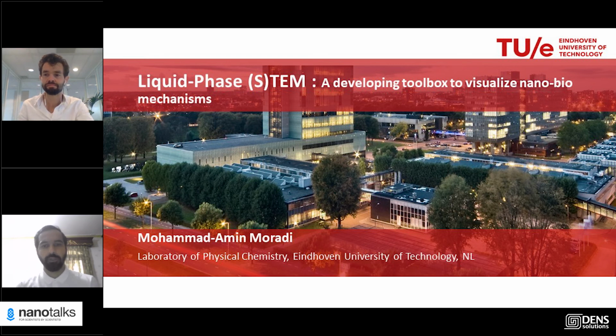Well, what I wanted to give the audience as the message here was that with graphene and the flexibility of the graphene to stand on any kind of spacer, you can adjust the medium, or let's say the aquarium, that you want to run your experiments in. So any kind of material you want to work with, you should be adjusting the spacer for your material.